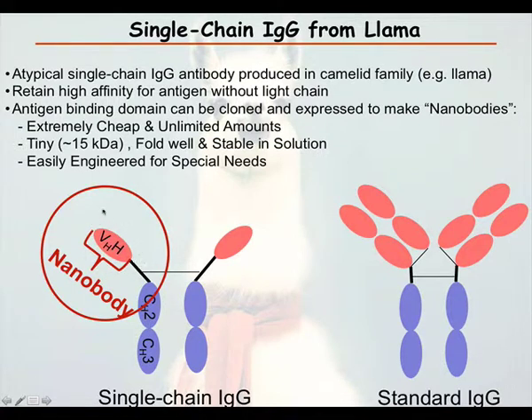And this is ideal for mass spectrometry, because if we can determine the sequence of this region, we can then very easily make a plasmid and produce it in E. coli. So we have a monoclonal antibody. And it's small, so we can easily work with it. We can maybe change it, it folds well usually, and it's very cheap to make.